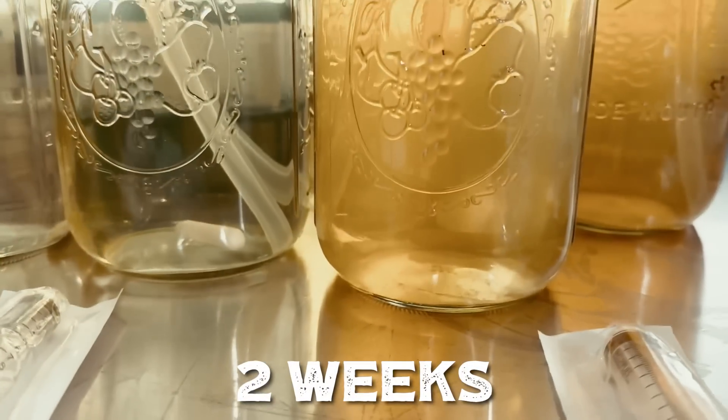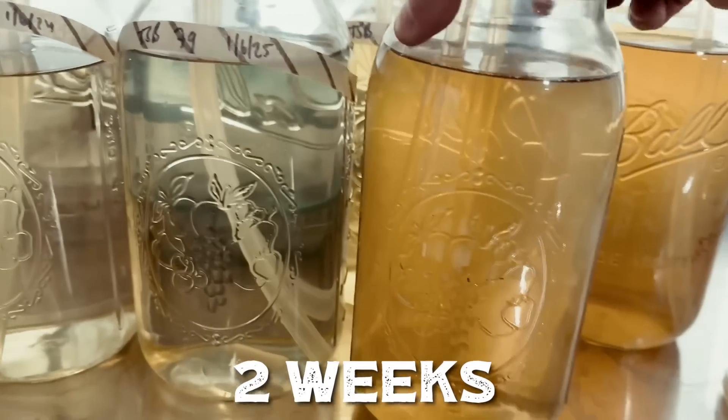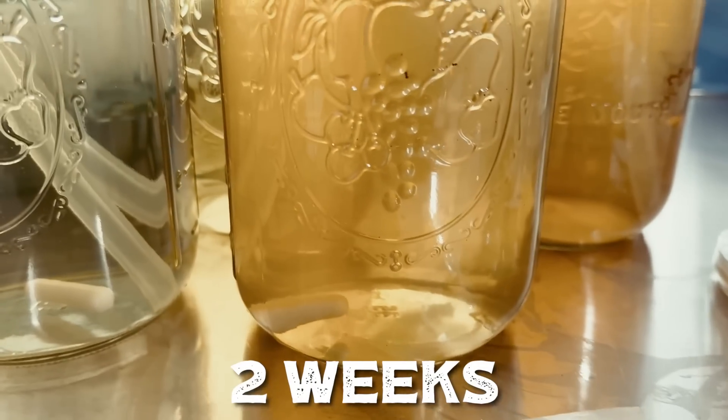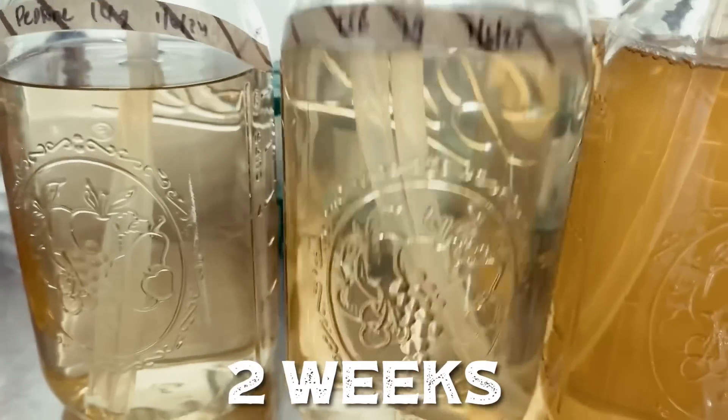It's almost been two weeks and the honey has significantly more growth than the other jars.